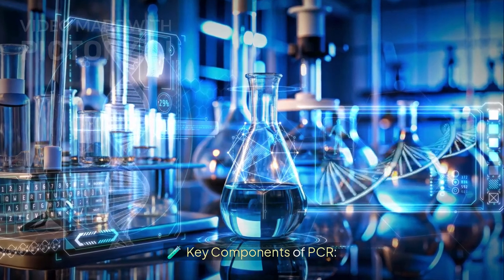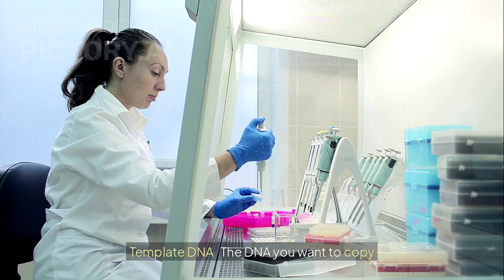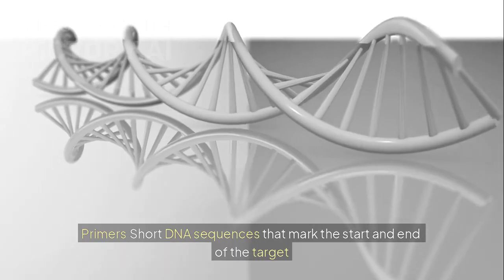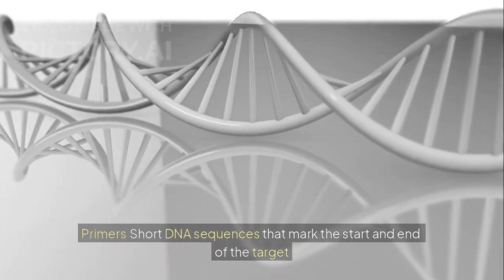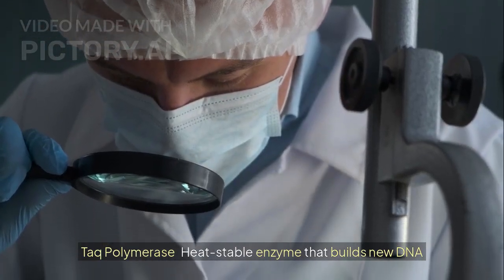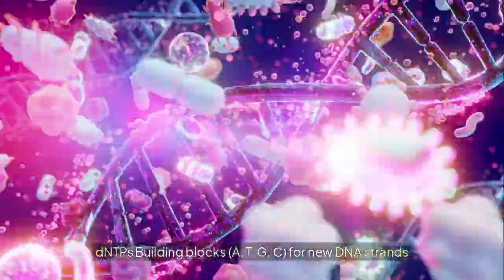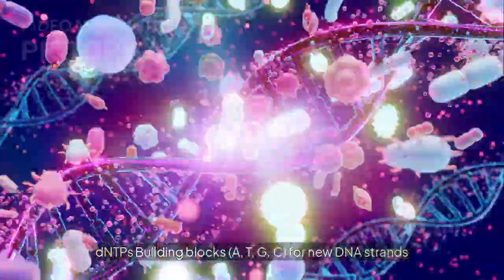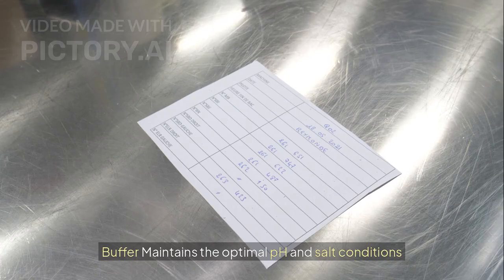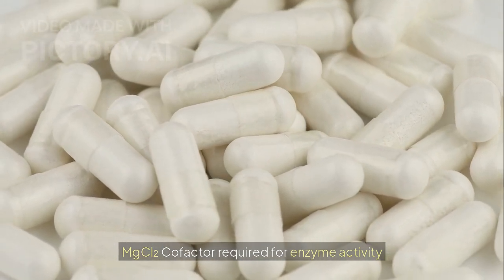Key components of PCR. Template DNA: the DNA you want to copy. Primers: short DNA sequences that mark the start and end of the target. Taq polymerase: a heat-stable enzyme that builds new DNA. dNTPs: the building blocks A, T, G, C for new DNA strands. Buffer: maintains the optimal pH and salt conditions. MgCl2: a cofactor required for enzyme activity.